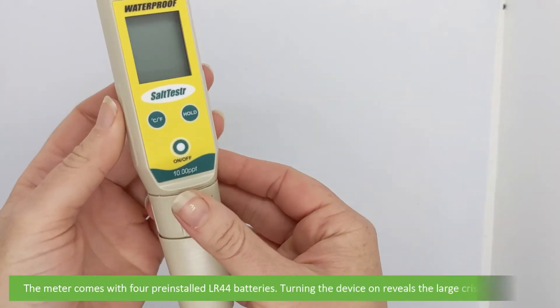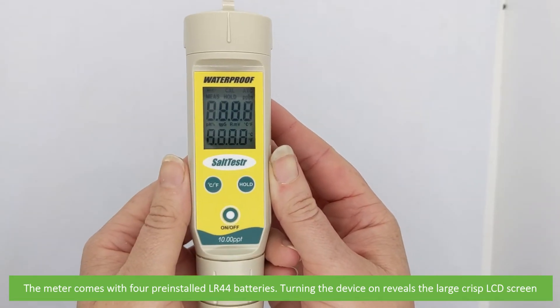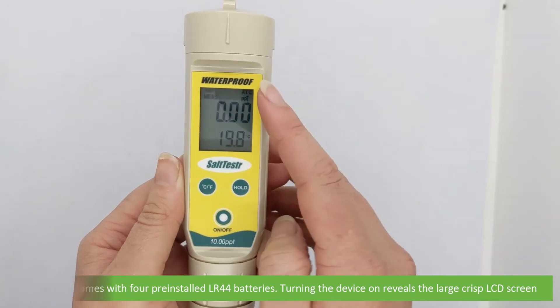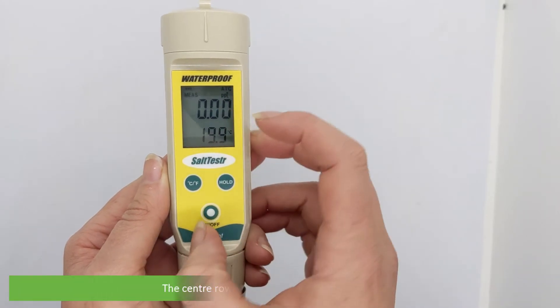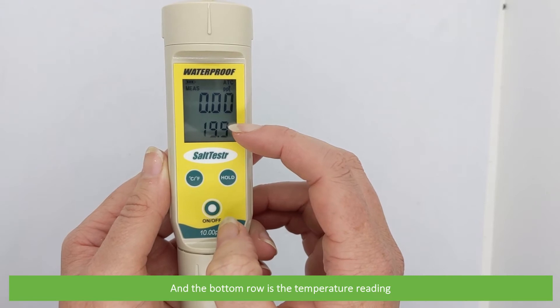The meter comes with four pre-installed LR44 batteries. Turning the device on reveals the large crisp LCD screen. The top row indicates the mode, battery state and measurement mode. The center row is the current salinity reading in PPT and the bottom row is a temperature reading.